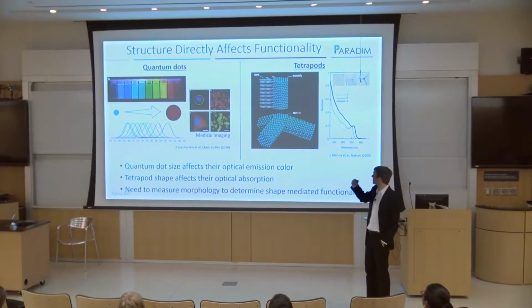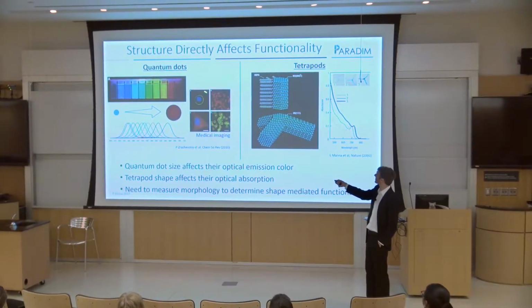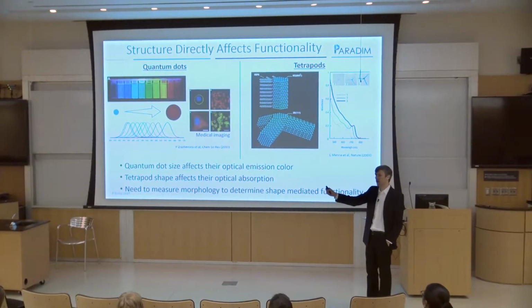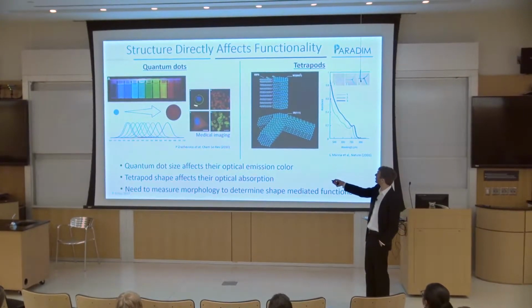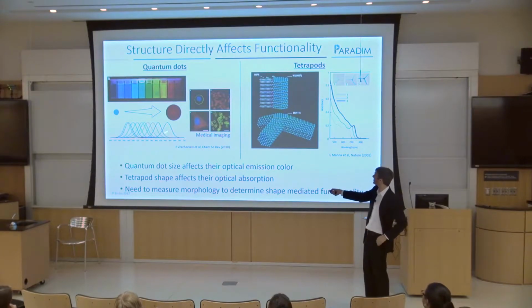So all these people are doing super resolution and imaging things at extremely high resolution in cells. And light microscopy is really good for that. But in light microscopy, the cell, like everything, is extremely complicated. But if you can get these quantum dots at different sizes to tag to different parts of the cell, you can make those light up by shining different light on them or by filtering out all the different light so you can see where all the different parts of the cell are without all the other overlapping parts. So they're very good at using these nanoparticles to tag things for medical imaging.